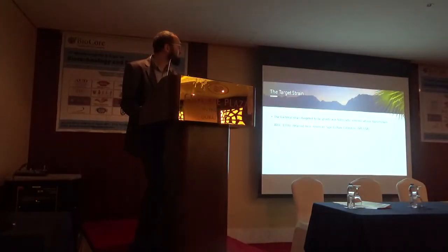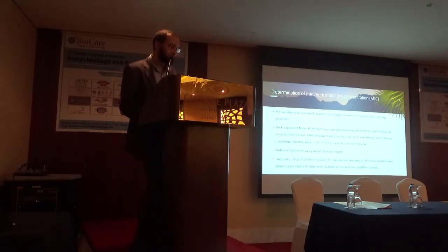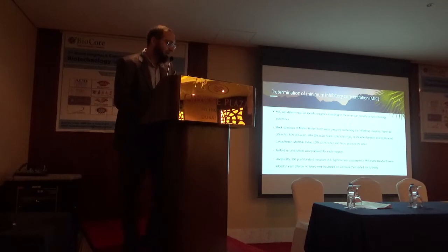The protocol: we have used one of the standard strains called Salmonella enterica serovar typhimurium, American Type Culture, by specific code. Actually, before starting the protocol, we determine the MIC, or minimum inhibitory concentration, for some agents.